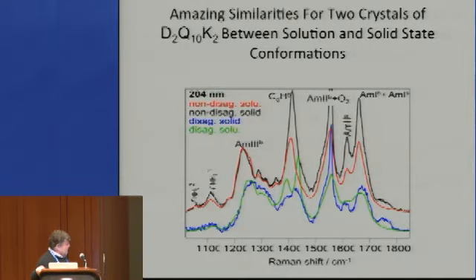These are 4 spectra, 2 from form 1 and 2 from form 2. These 2 spectra that look very similar to each other look a little bit like beta sheet, have some turns, and most resemble beta hairpin. So we make a solution of this, and then we evaporate the water, and we have a solid of this. The solution and solid spectra are very reminiscent, and they go back to one another all day long.